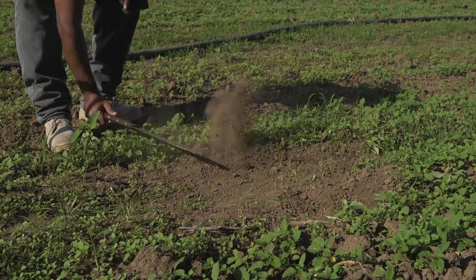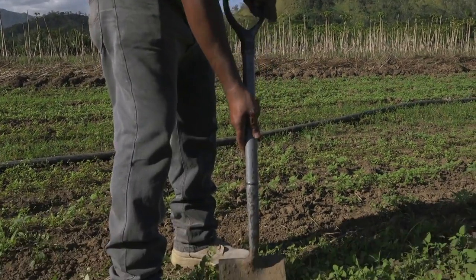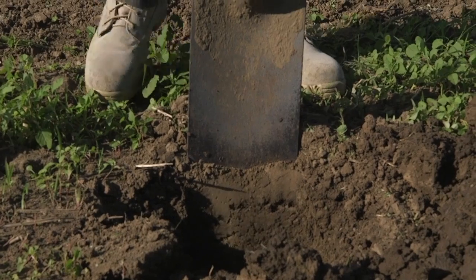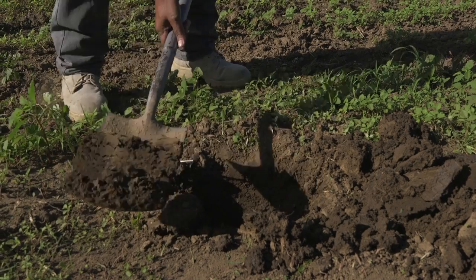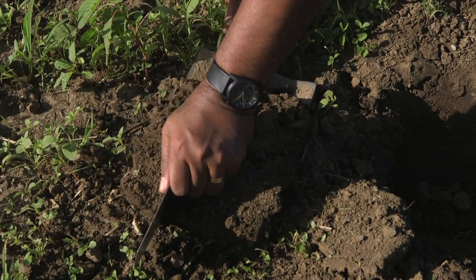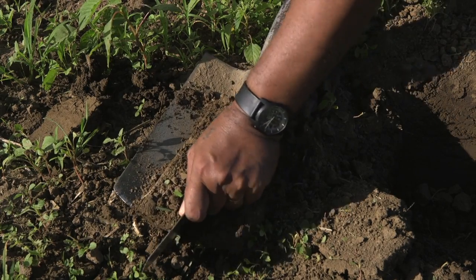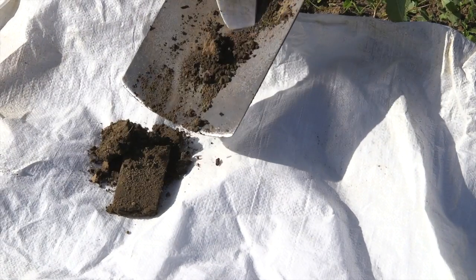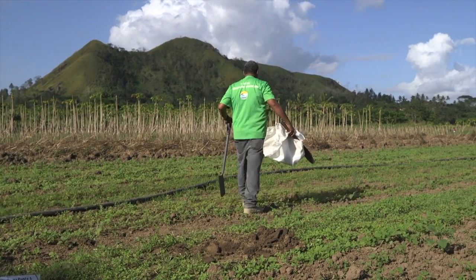This is how you will take soil from each point. Dig a 20 centimeter hole and cut a thin slice from the side. Taking the soil, lay the spade down, then remove a third of the soil from the left and the right with the centerpiece remaining. That centerpiece is collected for testing. Repeat the same process for the rest of the points.